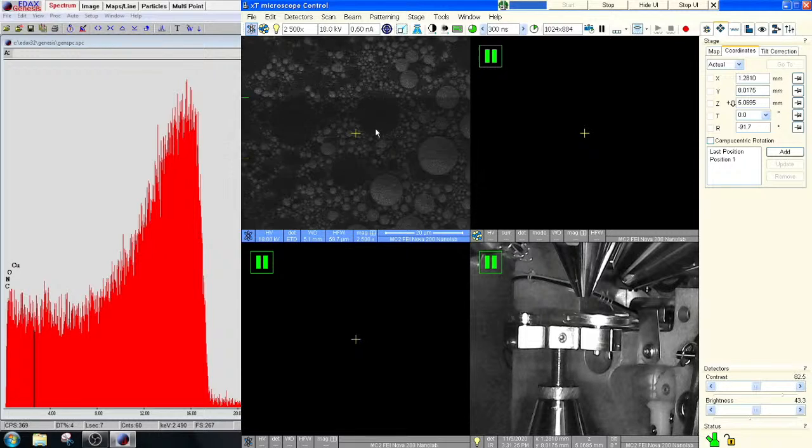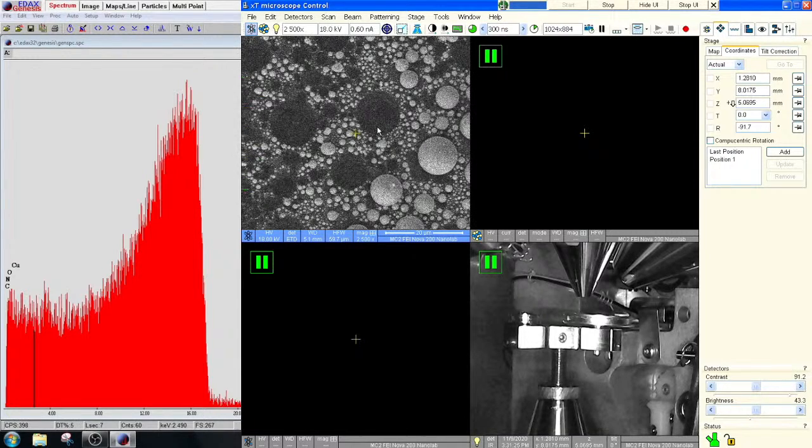So when you do that, it turns on the high resolution electron lens at about 10% power or so. And that lens field from the high resolution immersion lens will act as a filter, and it prevents this garbage signal from getting into the EDS detector.